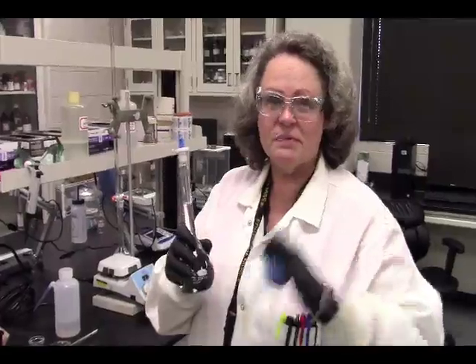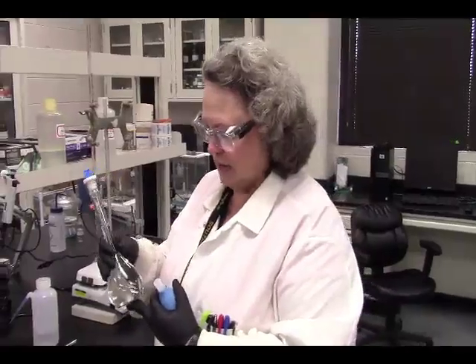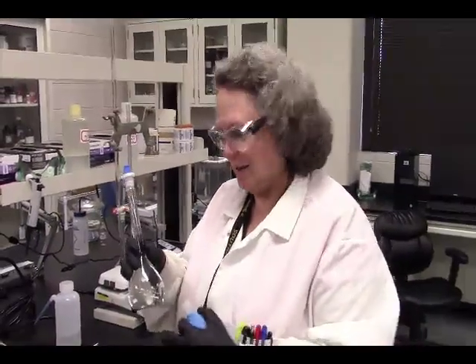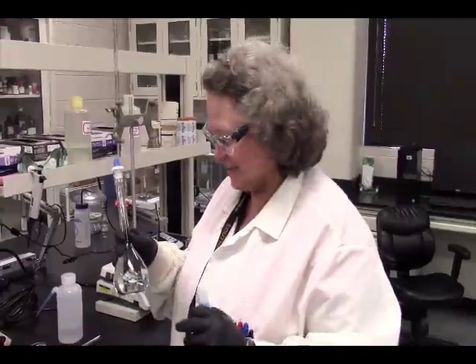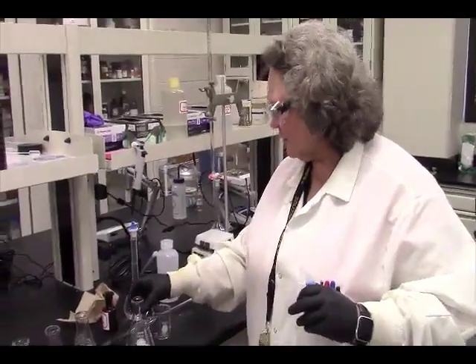Potassium iodate has been dried, weighed until we have 0.3 milligrams between those weighings. And so I feel your pain with doing that because it's a little bit painful, time consuming. But we have our standard potassium iodate solution. Then we have our sodium thiosulfate solution that we made.